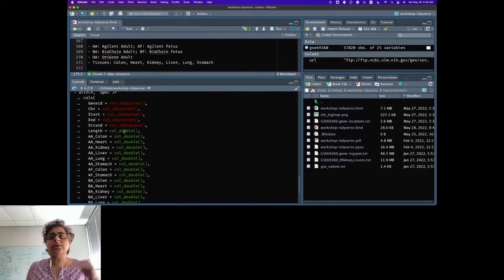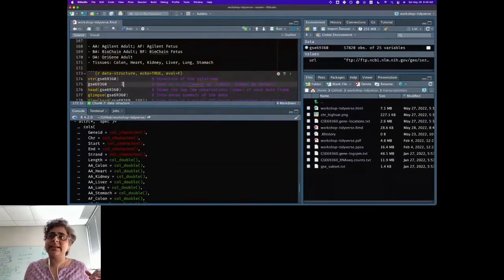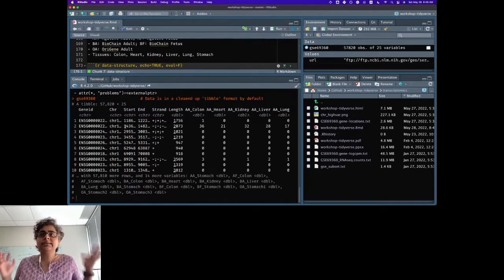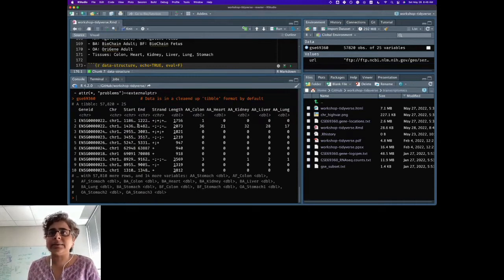And then it shows you what the data types are again. Let's see if there's a slightly better way to look at it. Let's just see what happens if you type the variable name by itself. This is already better, right? That's because we loaded it with a cleaned up data set. And there is a typo here.